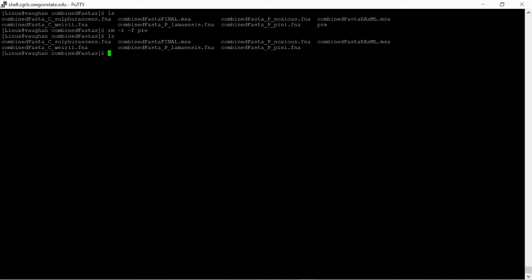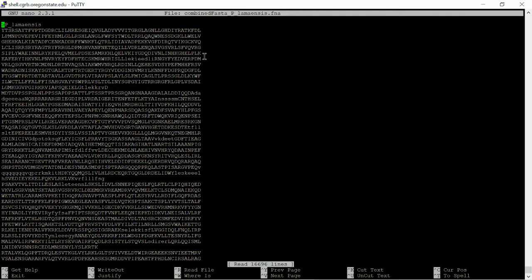Where we left off from video number four is we have each one of our individual concatenated FASTA files. Each file here contains all the Busco genes with only one header at the very top for each sample.